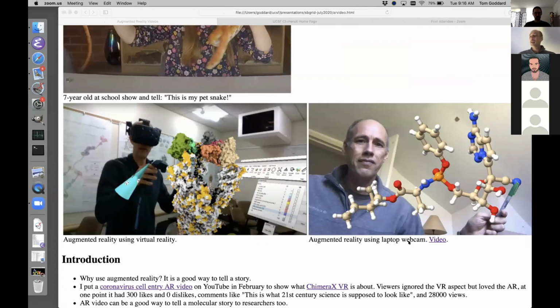So that was a little demo, just a live demo of doing the augmented reality. To record a video of that, I just do some screen capture, with whatever screen capture program. On Windows, I use Flashback Express or Flashback Pro. So let me show you.